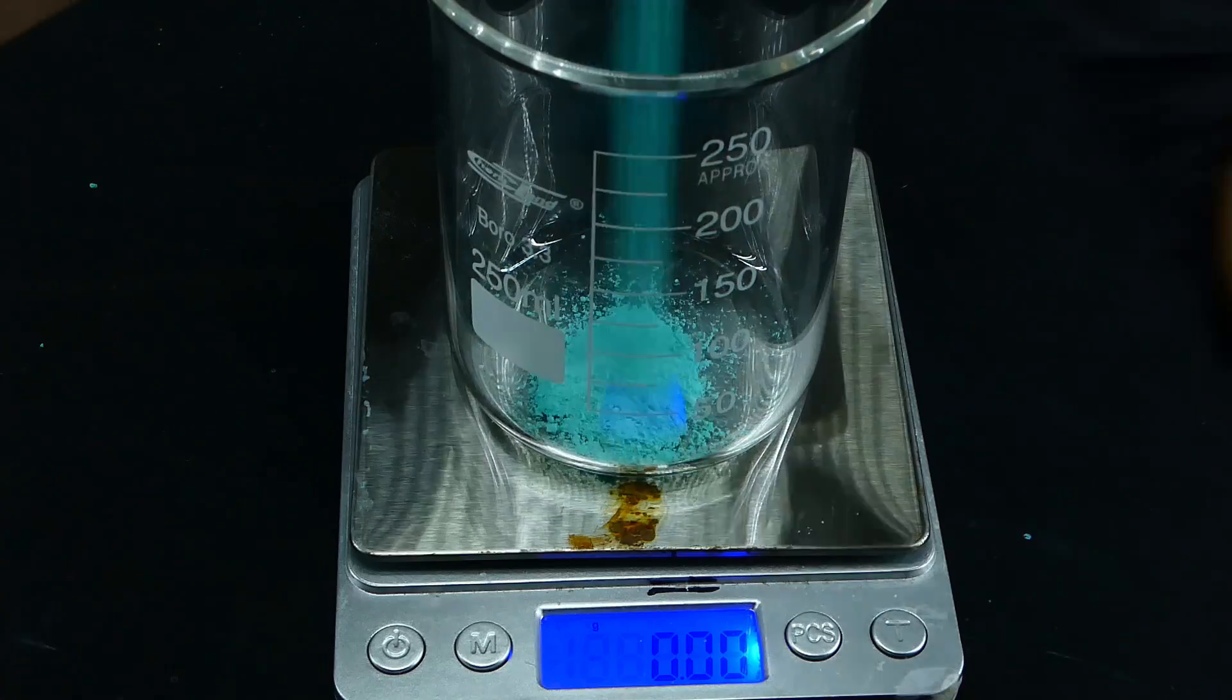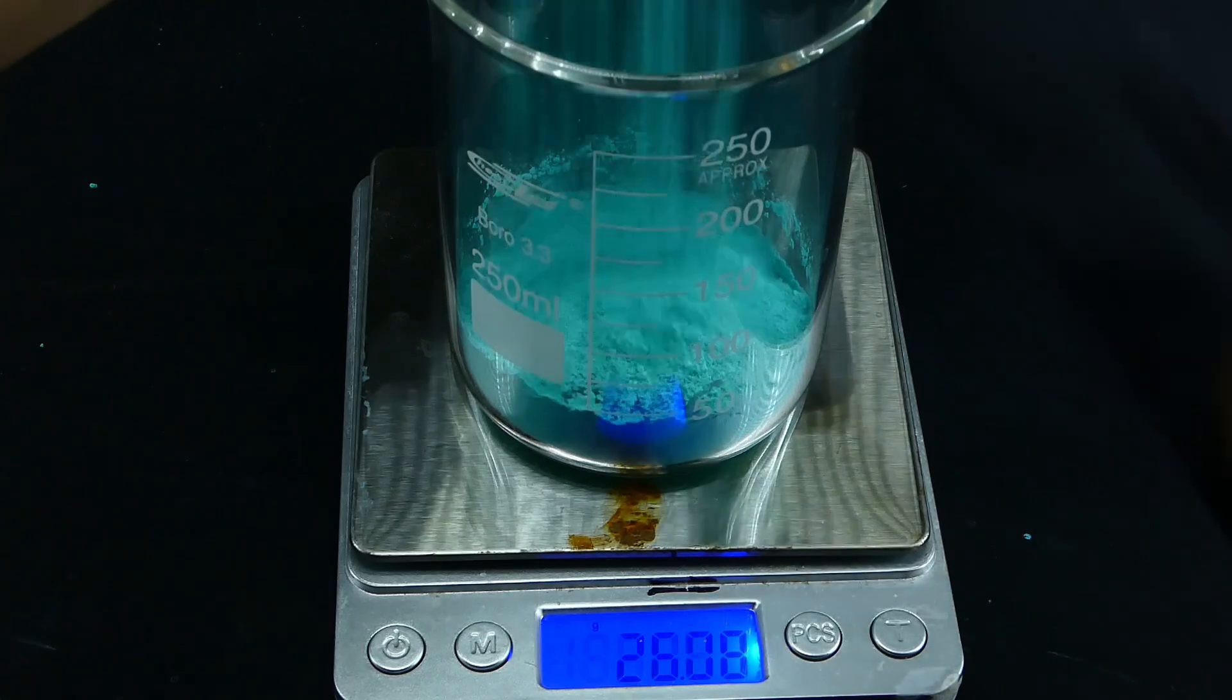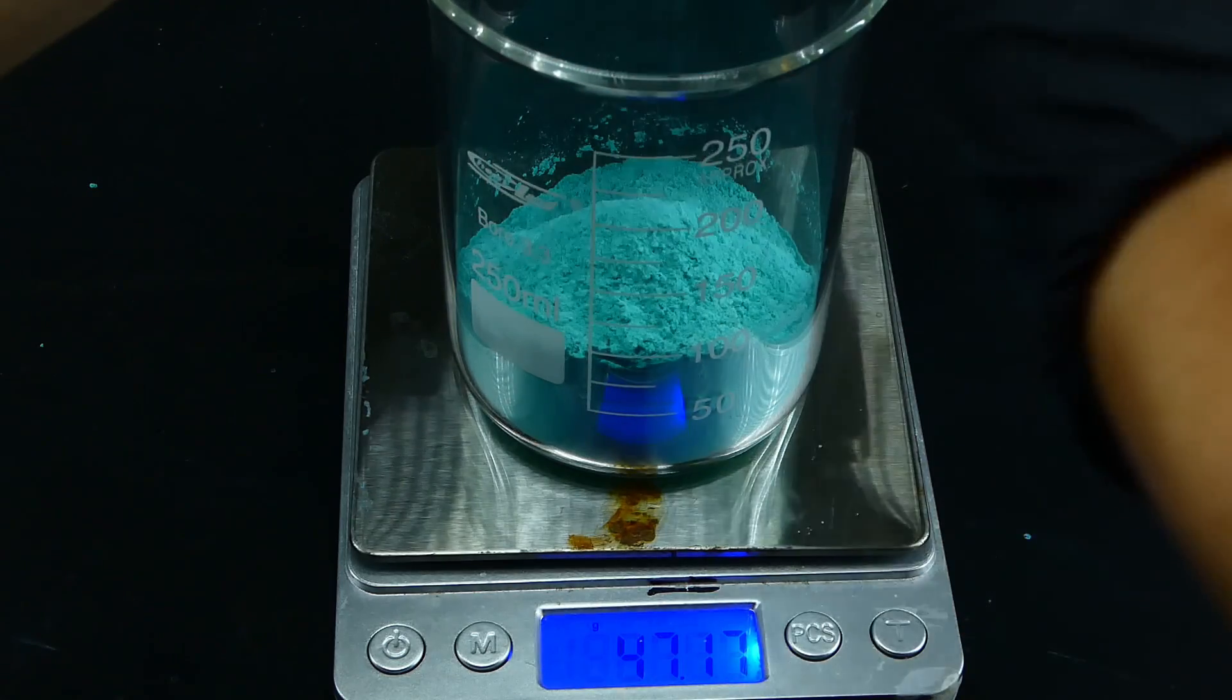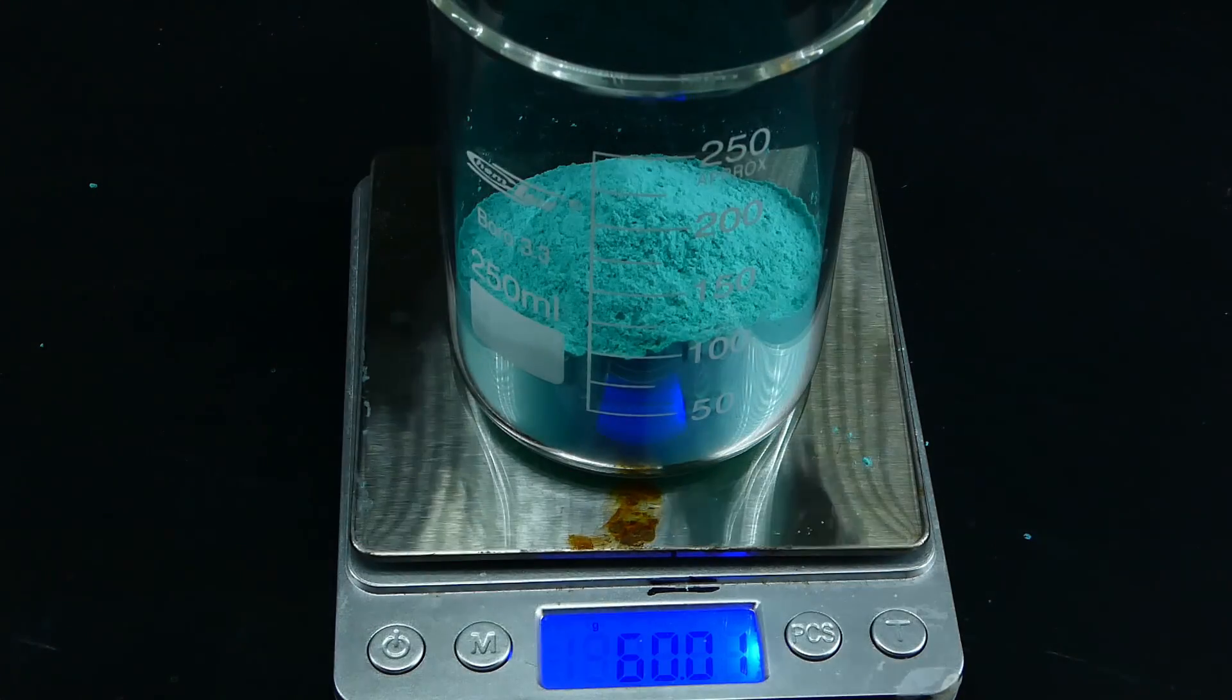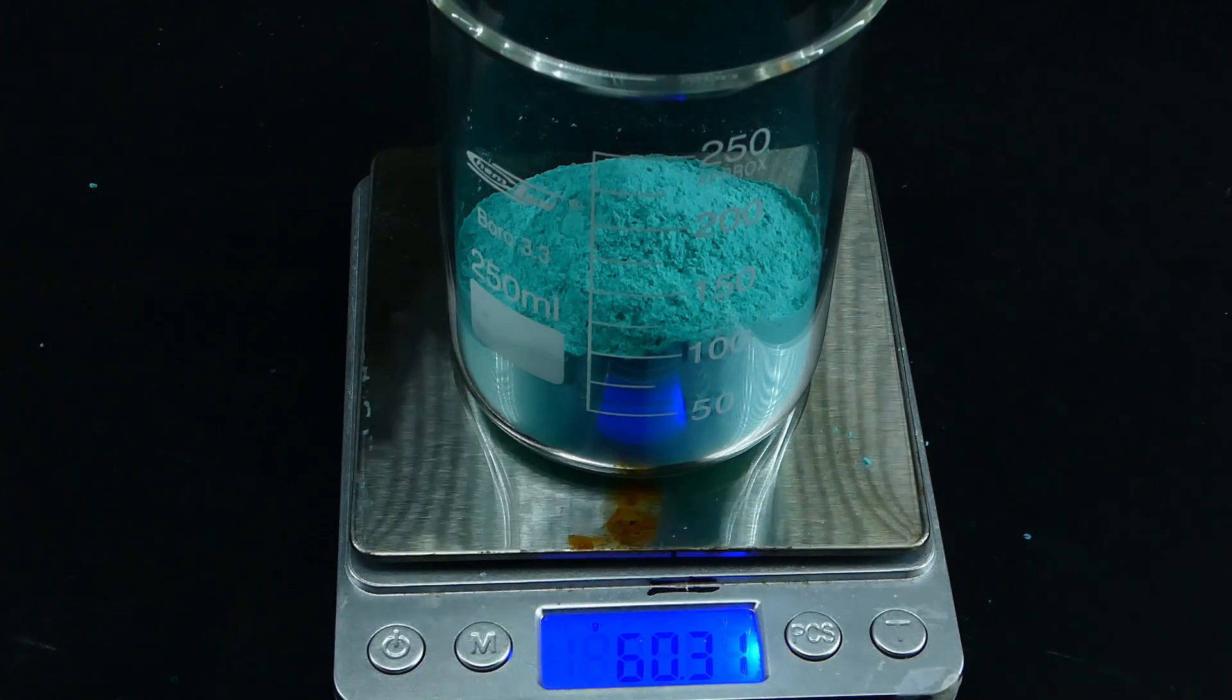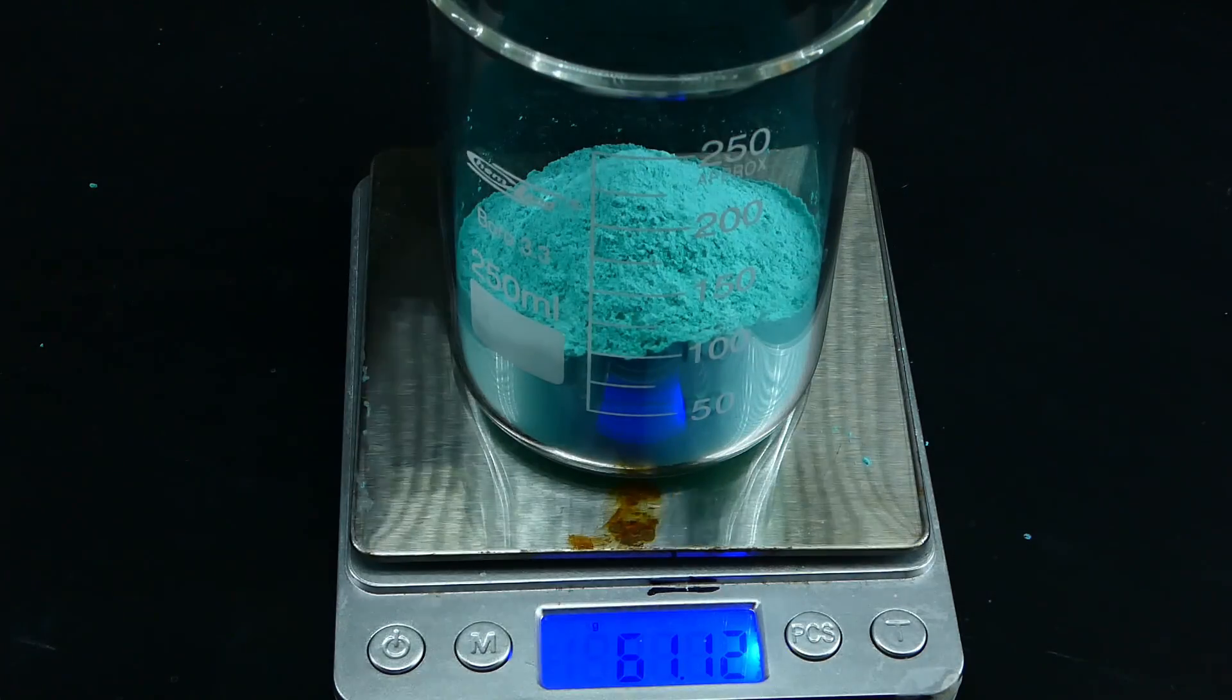After that was done, I weighed the powder and it turned out that I got 61 grams of my product, which is a pretty good yield that is much more than enough to make the pyridine. Since I have so much of it, I decided to have some fun with it and make a crude paint.